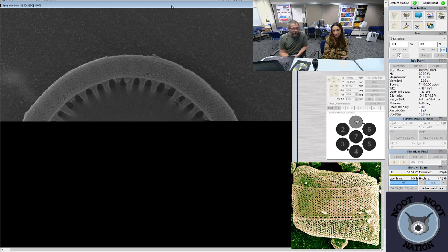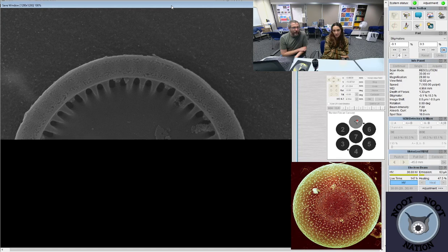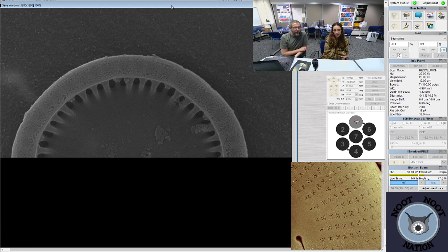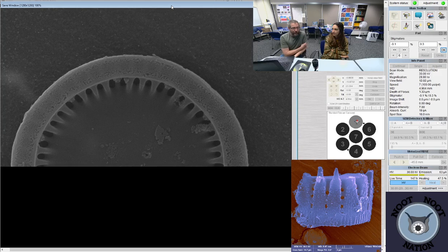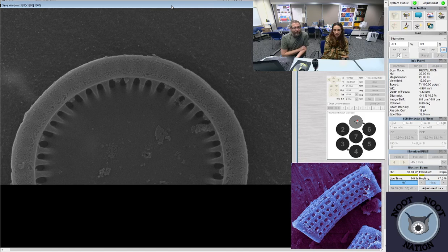There are some diatoms where it's useful to also see the arrangement of their chloroplast, for example, to get it into the genus. But for the most part, you don't need those things. You can just look at the structure of the skeleton to tell what you're looking at. And while there are some things that people have observed as cryptic species where you can't tell them apart except by looking at their DNA, or at least it'd be very difficult to tell them apart, most of them you can at least get into the genus and usually into the species.